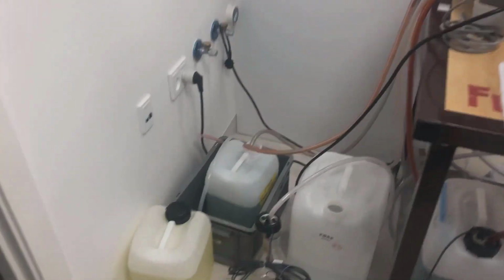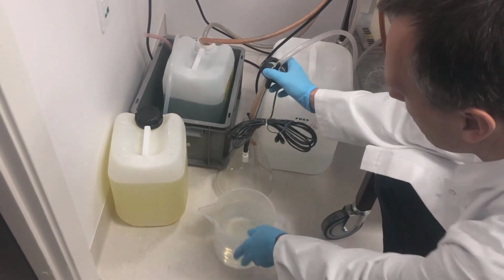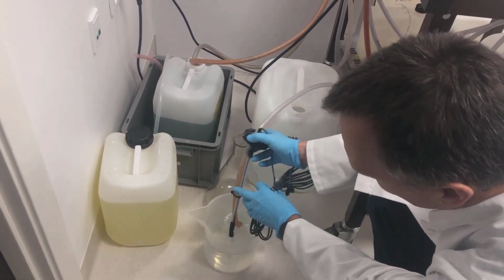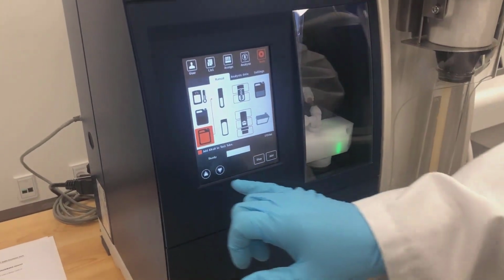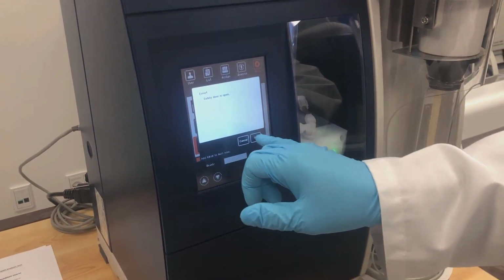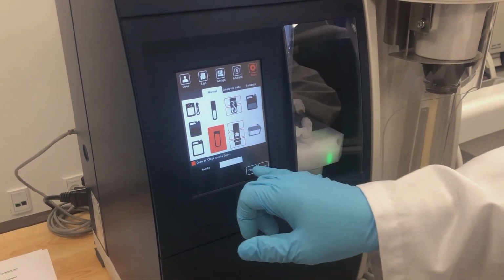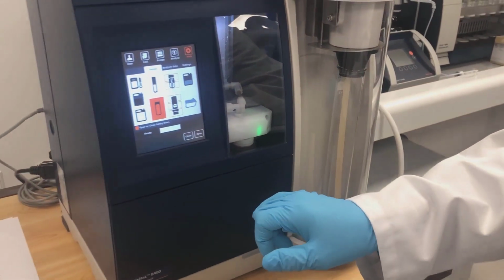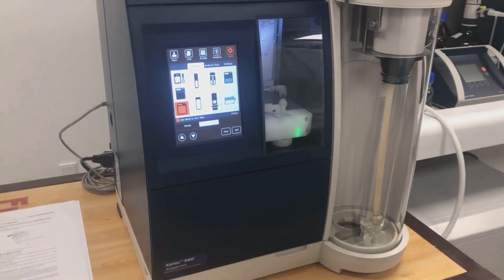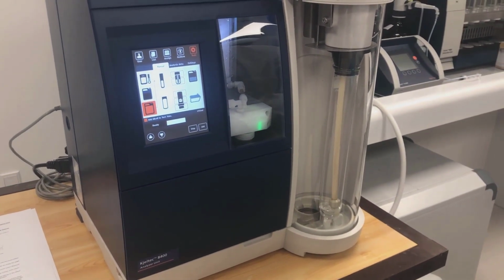Next step is to reflush the tube, so we put the tube in a flask that contains some warm water. Then we use the add ALKALI function to reflush the tube and the ALKALI pump. First we still need to close the safety door. Choose the maximum volume for adding, and you have to repeat it several times.